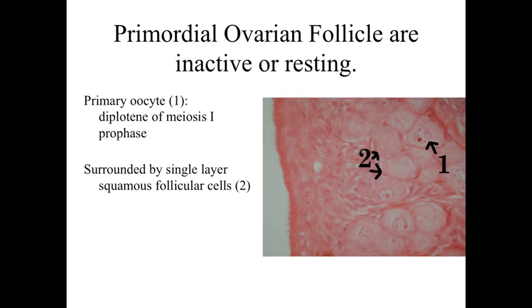The majority of the ovarian follicles are going to be referred to as primordial ovarian follicles, and they're going to be in an inactive or resting phase. We see a relatively large primary oocyte with a distinct euchromatic nucleus and a very prominent nucleolus, surrounded by a single layer of follicular cells. In the primordial or resting ovarian follicle, these follicular cells are going to be squamous — relatively flat — so they're inactive.